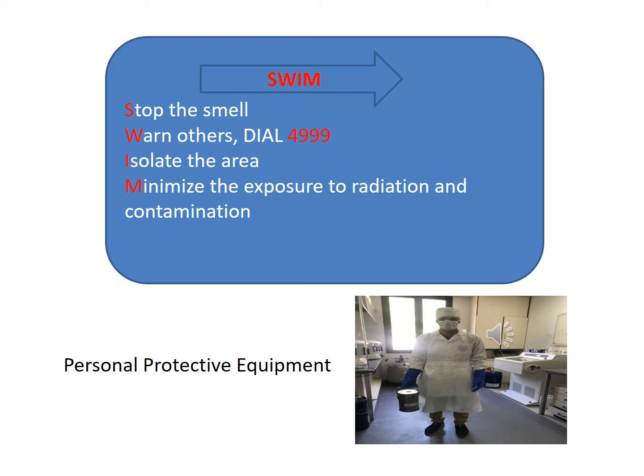If there is a chemical spillage, try to avoid the vapors, aerosols, or other contents that may evaporate into the lab environment. Stop the smell means you should carefully avoid taking deep breaths in that area. Then W, warn others. For example, your friends may be working in another corner of the lab, so inform them as well.